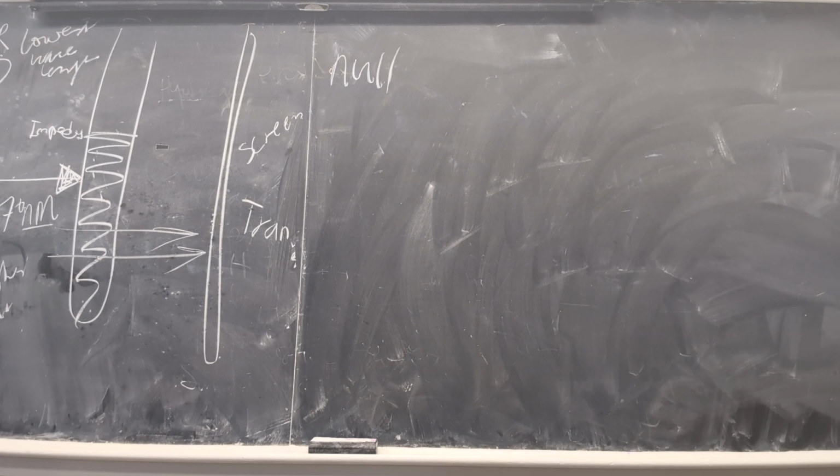That is more than what you need. Yeah, that's fine. Do you guys need more? Alright, so you need a blank. You need one for calibration. So get one test tube full of water. Wait, how much water should I put?